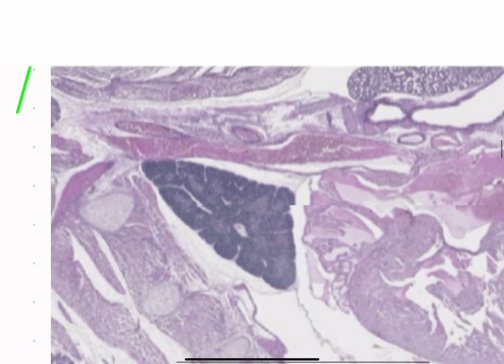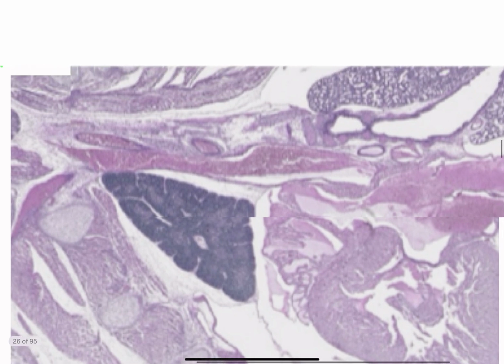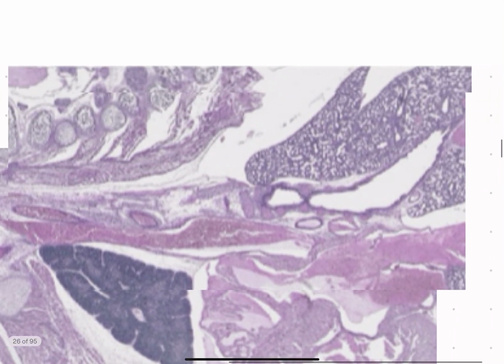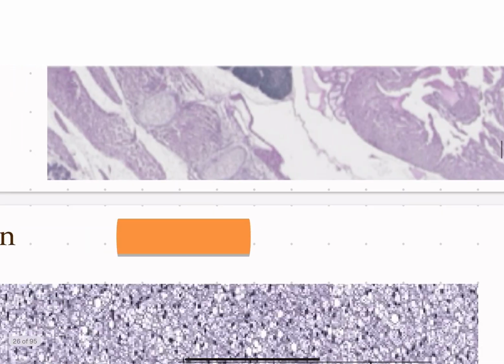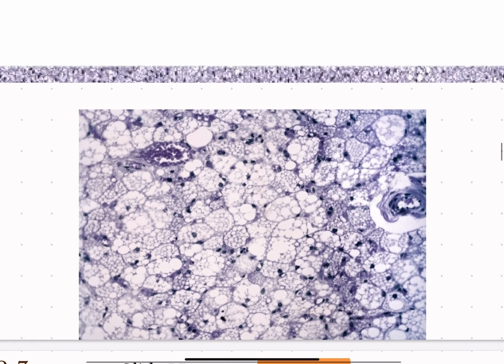We are in the same slide. So the same slide as previous, please write down the same name for both. But now we're going towards up. So previously we went towards the right, now we're going a little bit up. And we see this general area. And now we're going to zoom into this general area. And we see something like this. Whoop, pixelated, that's great. But zooming in, we can actually see something like this. Tell me the name of this structure.